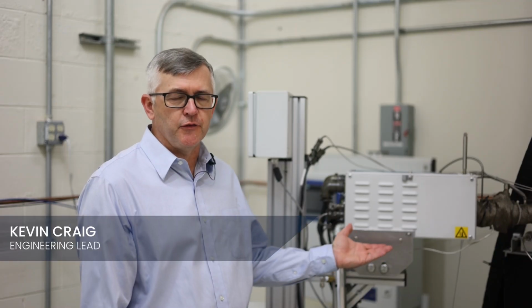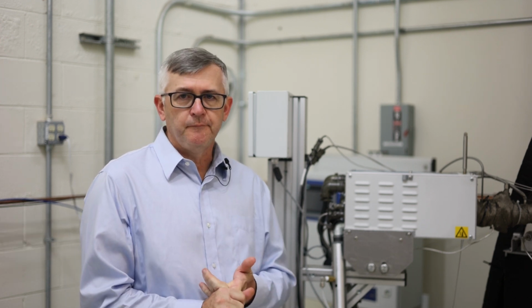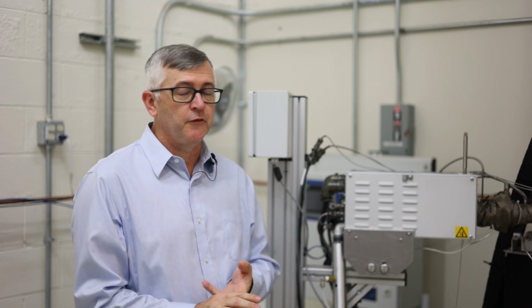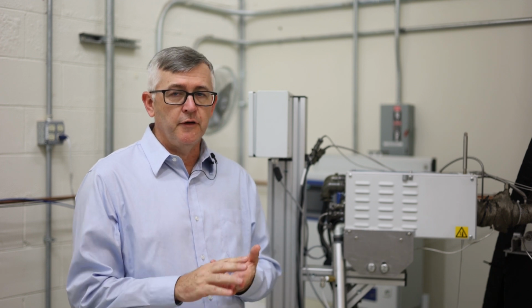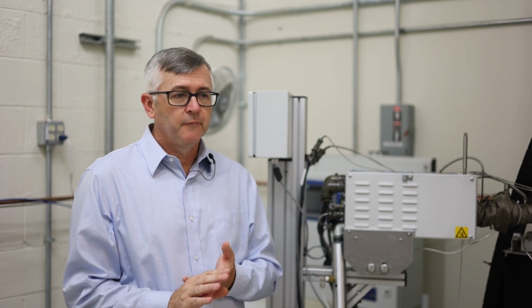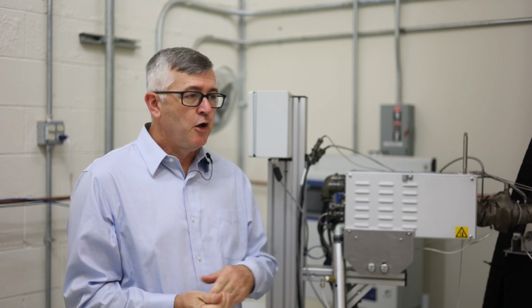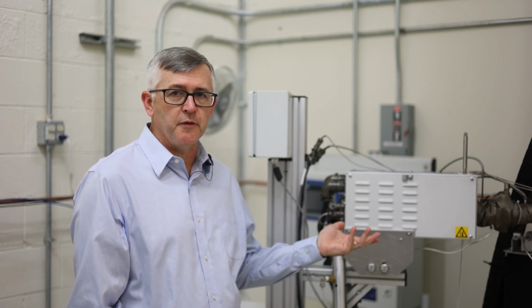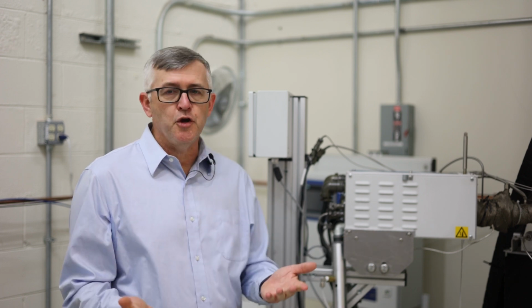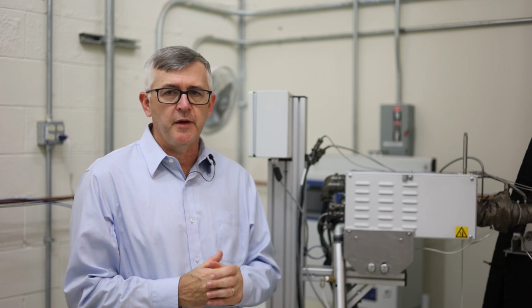The ViscoIndcator measures primarily 3 data points. Melt flow rate, for those in the polyolefins and other materials that are interested in that. Viscosity of the material under the conditions it's being measured under. And intrinsic viscosity for those in the polyester and PET worlds that are interested in those measurements. We also report shear rate and shear stress of the material, test temperature, and the data you would want to know that your material is being subject to while being tested.